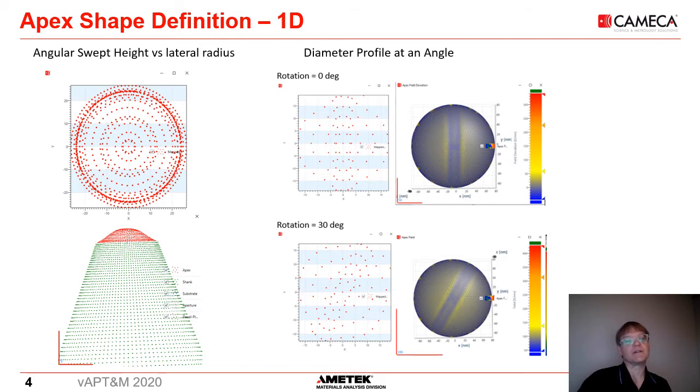For planar features and a cross-section orientation, we now also support the use of a full diameter profile that directly modifies an equilibrium or spherical shape with a height modulation. Here we have imposed a slight concave groove through the center of the apex and show the trajectory maps that result from these models.